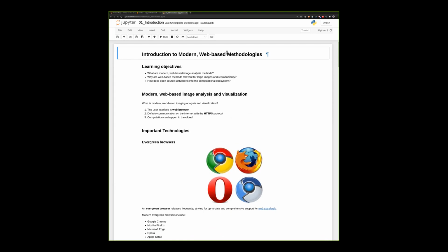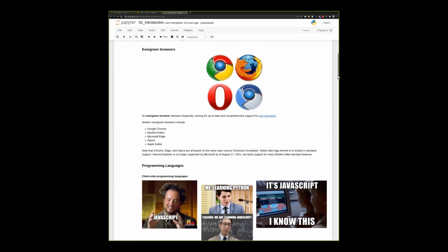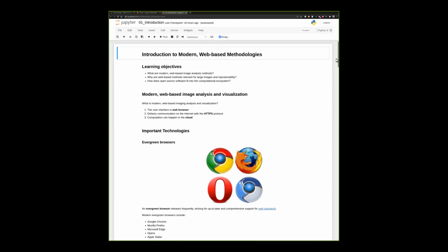If you're still getting the software environment up and running, hopefully you'll have it running by the end of the session. If not, I'll help you at the end of the session. We're going to have a 5 to 10 minute break between each session. But this first session is a little longer, with some background. We'll do exercises at the end of each section.